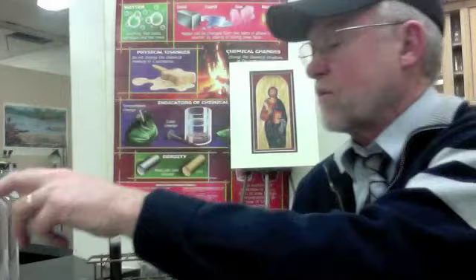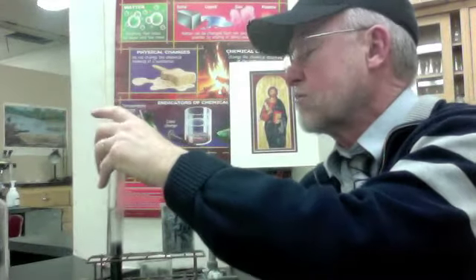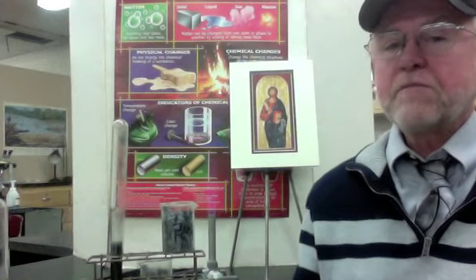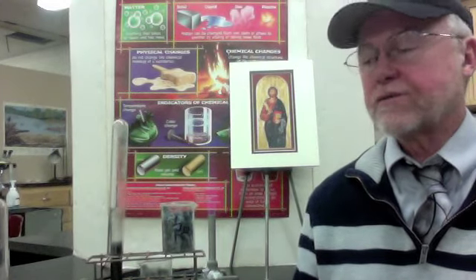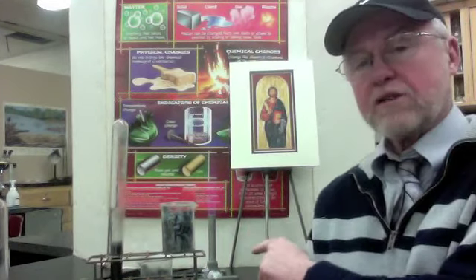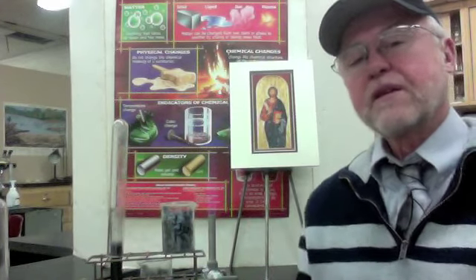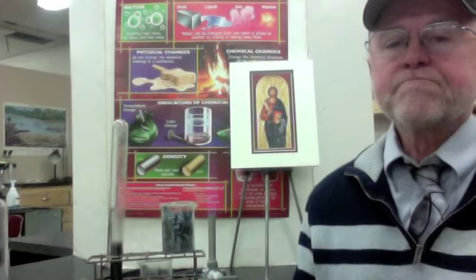So yeah, we could generate a little bit more hydrogen, catch that hydrogen there. So that's basically the lab. Wasn't very complicated, was it? But I'll tell you what, let's discuss the reaction. Okay, so here we have a combustion reaction. Methane and oxygen are combining to make two products.